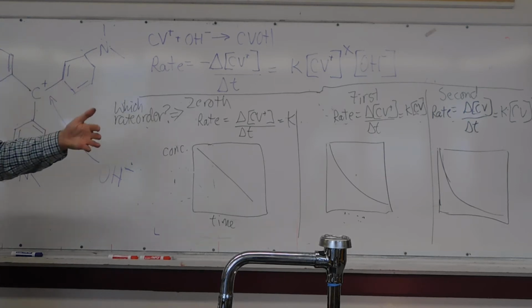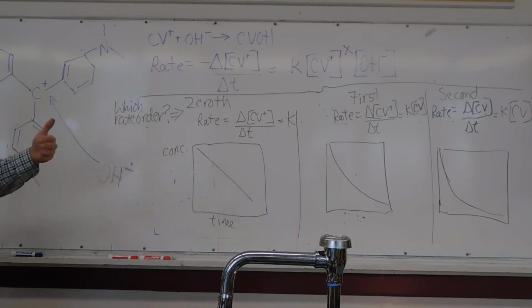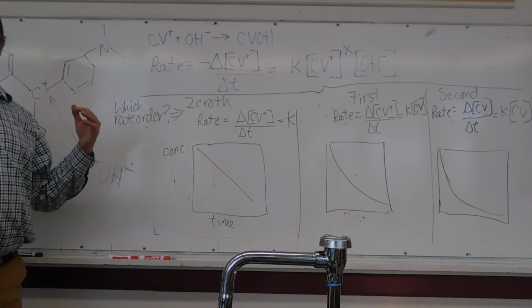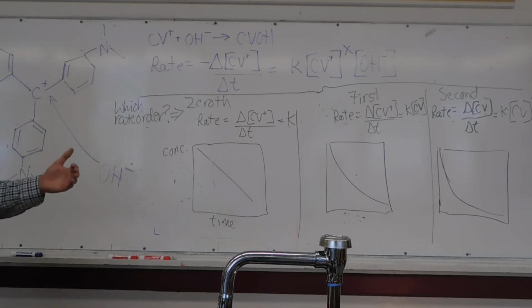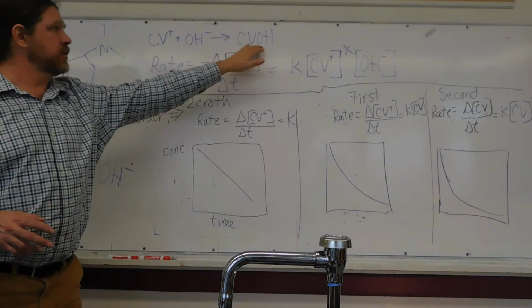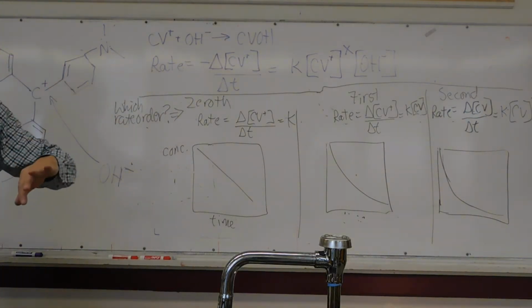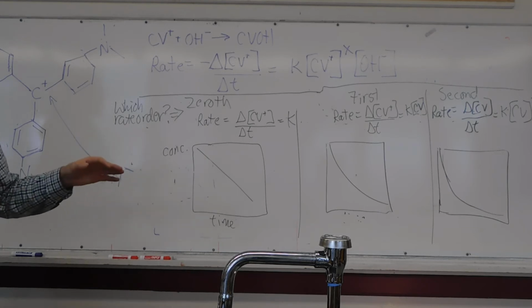We see that change in electron configuration as a gradual disappearance of the purple, ultimately to a clear solution overall. So, because of this, we can use spectrophotometry to determine quantitatively a rate of disappearance of our reactants, and thus an appearance or formation of our products.